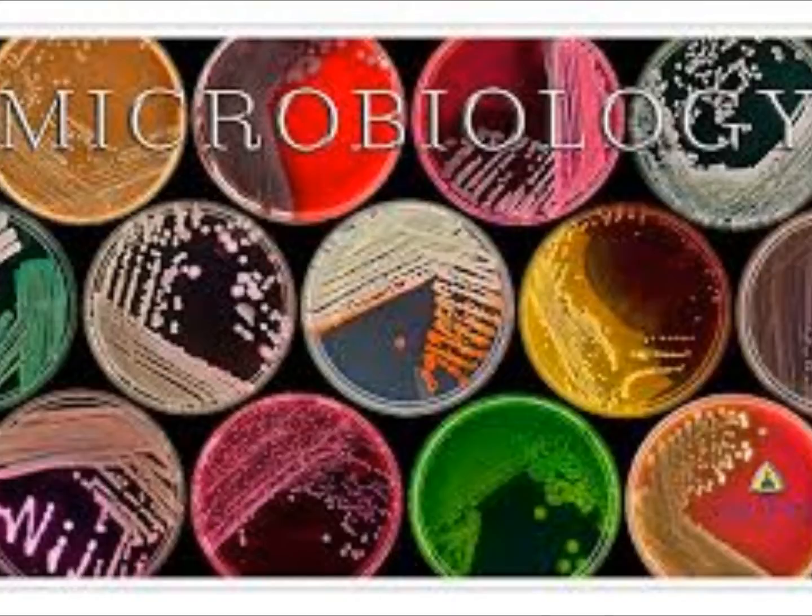And remember, on color, what might be off-white to you might be gray to someone else, unless color is distinct, like micrococcus with the lemony yellow. Color doesn't always give you a big clue, but you always need to record it as a descriptor because it helps the next tech who's looking at it. Don't sweat it if you call it off-white and someone called it gray. Sometimes in the lab, we'd call something white on the first day and then the second day it was buttery. Staph aureus is really good for that. It'll look white on day 1 and on day 2 it'll have a real pale yellow butter color.